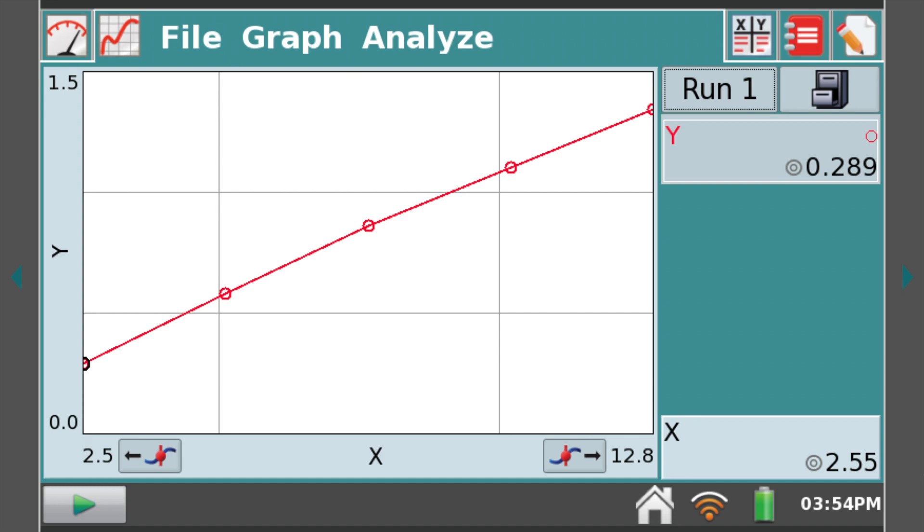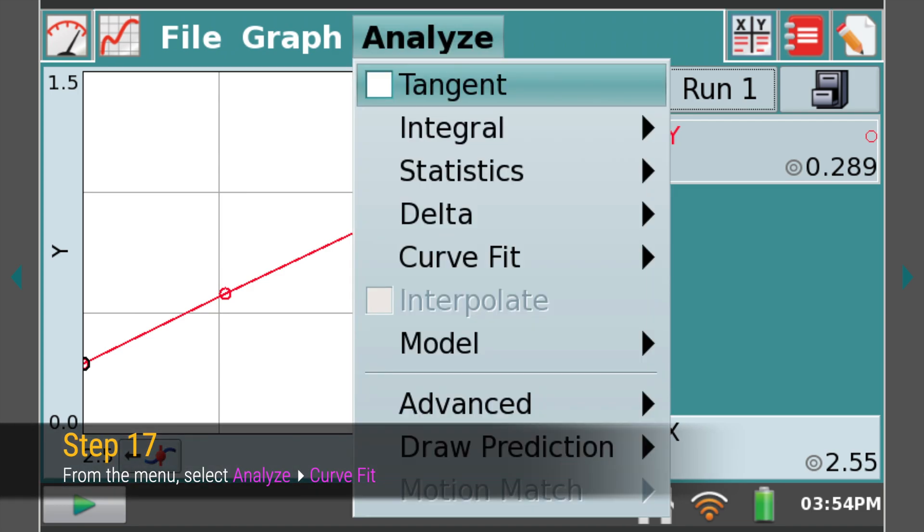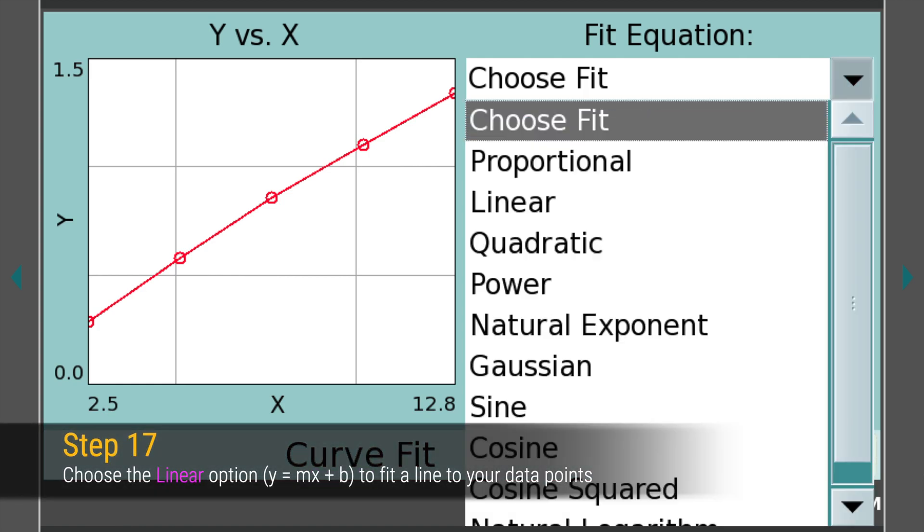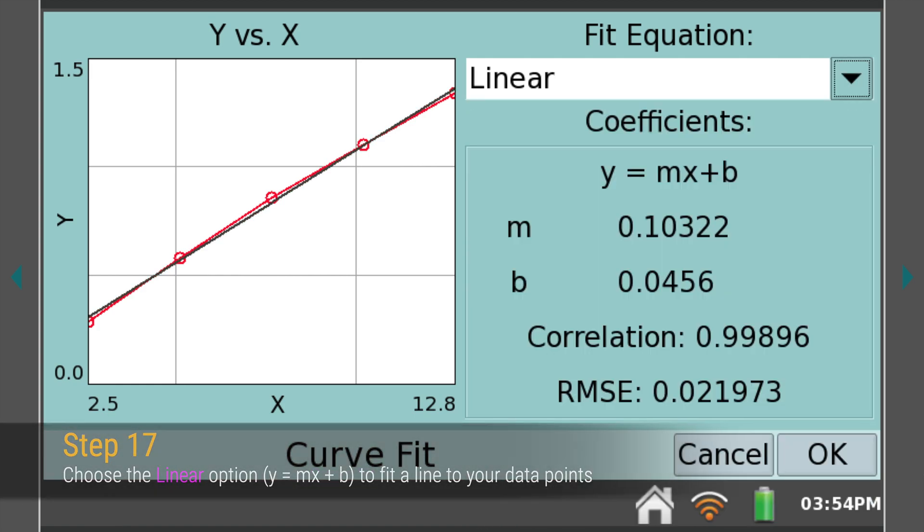To obtain the slope and y-intercept of your Beer's Law calibration plot, select Curve Fit from the Analyze menu at the top. Now select Linear from the drop-down menu, and note the values of the slope and the y-intercept for your data.